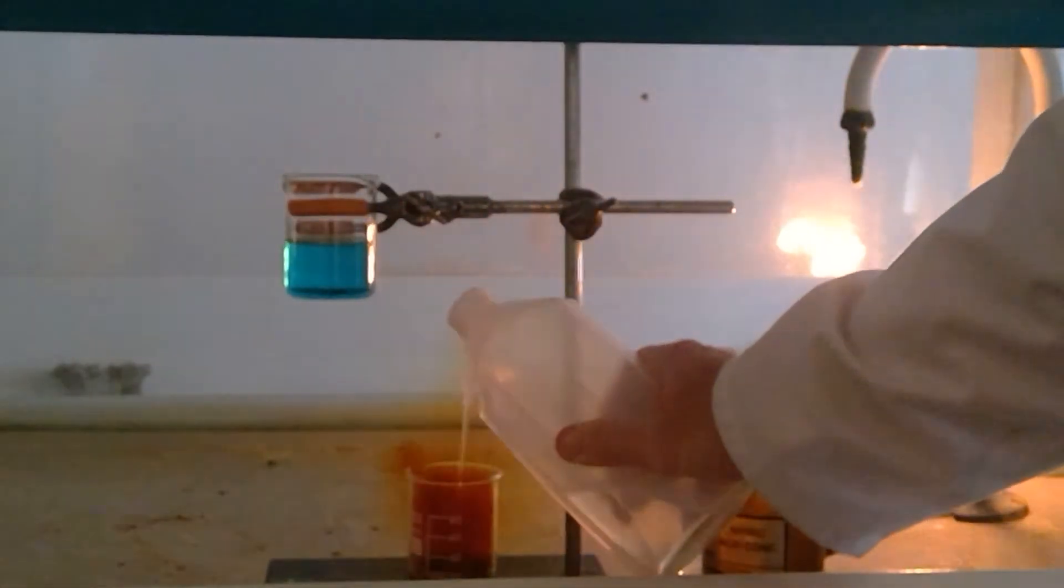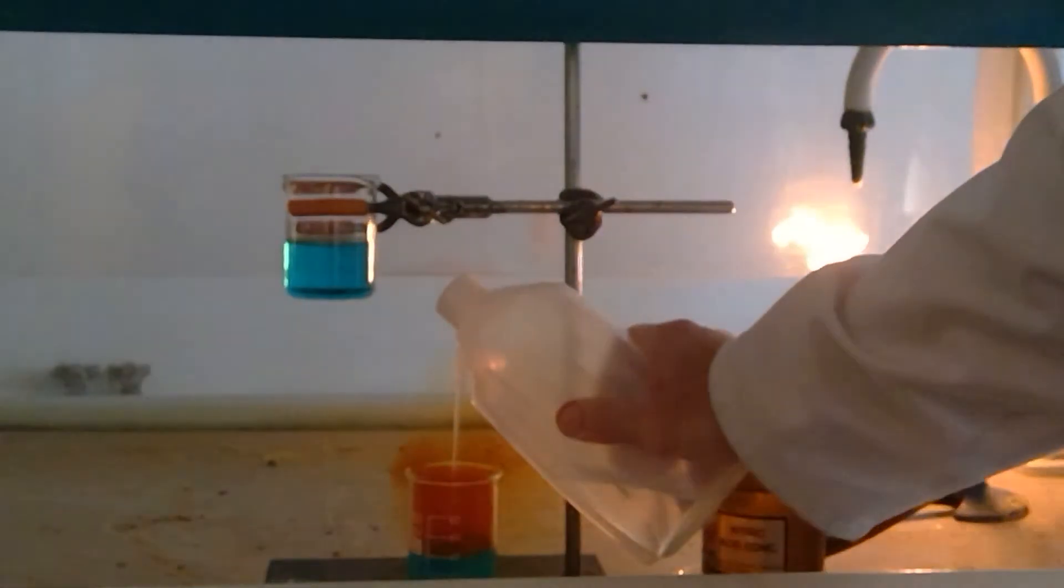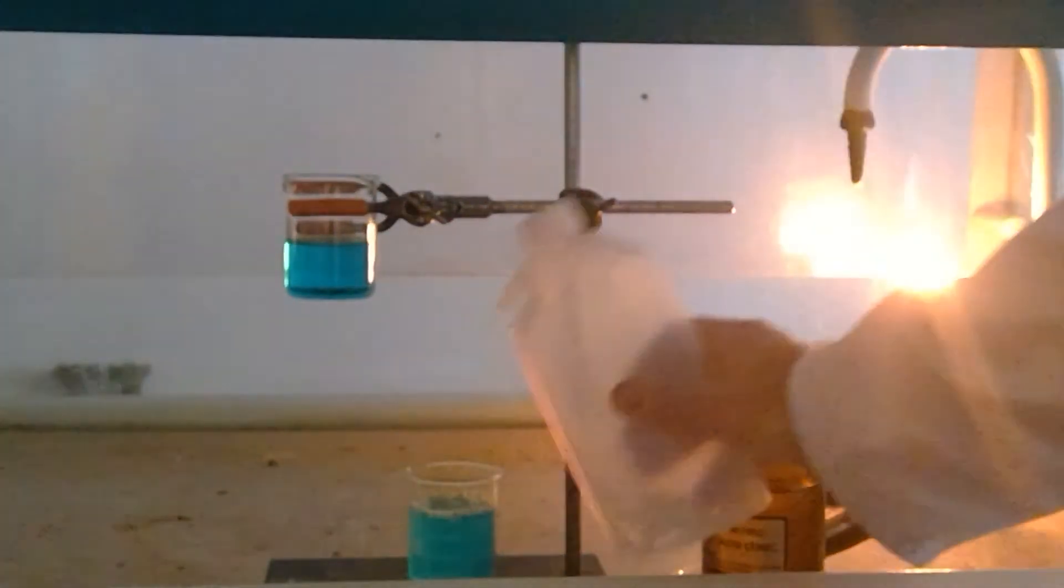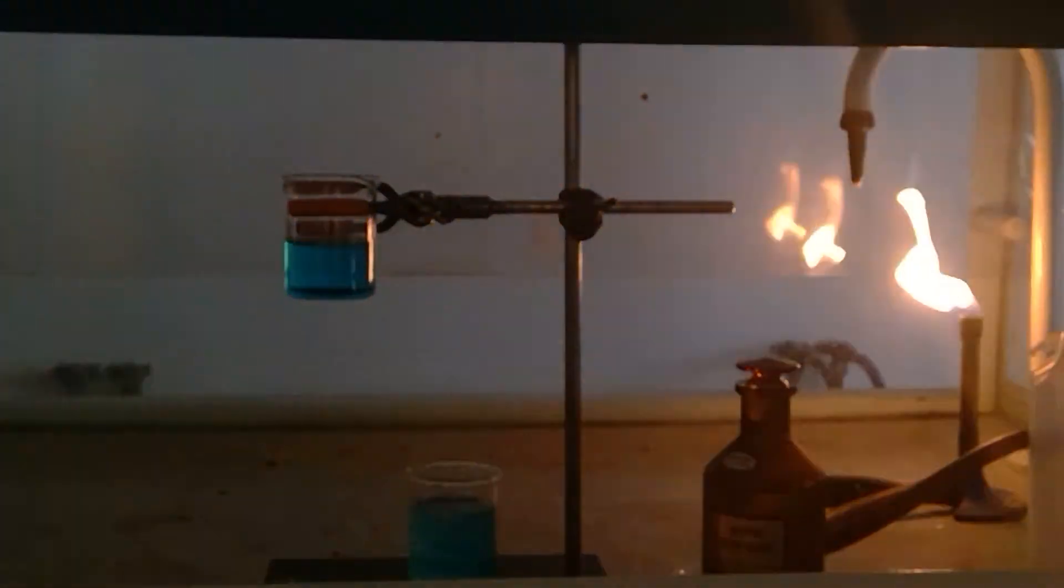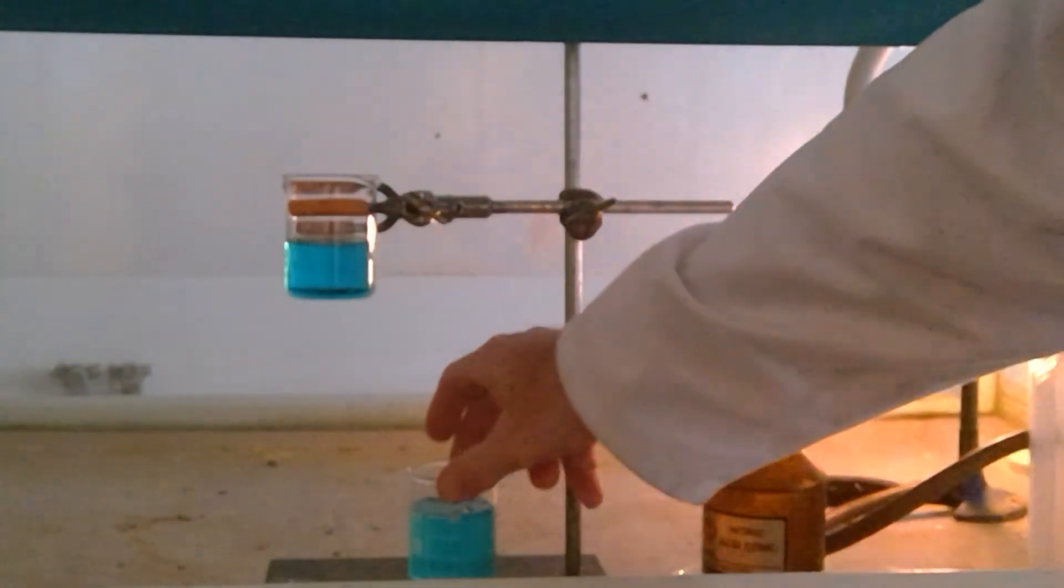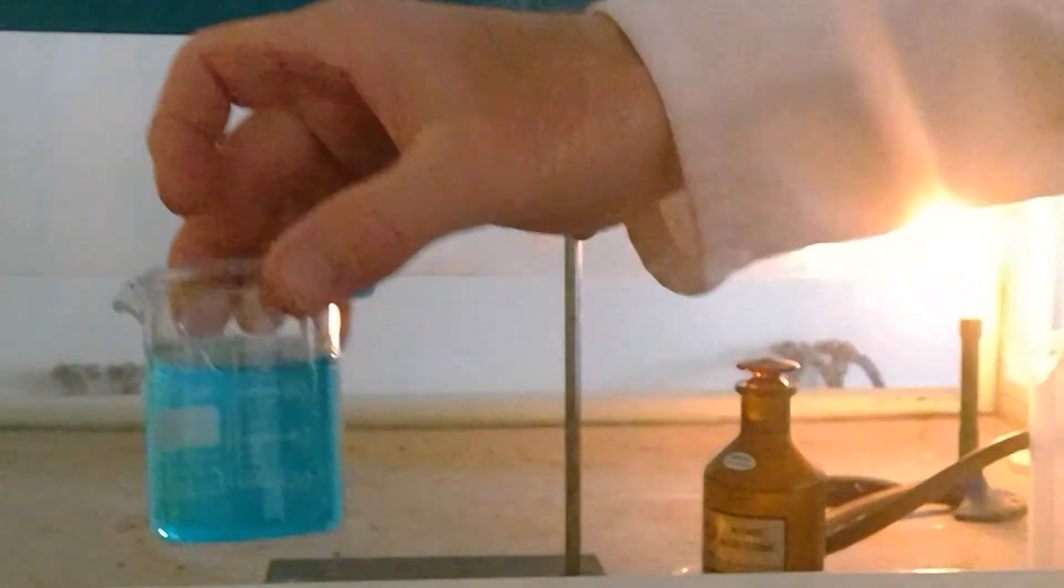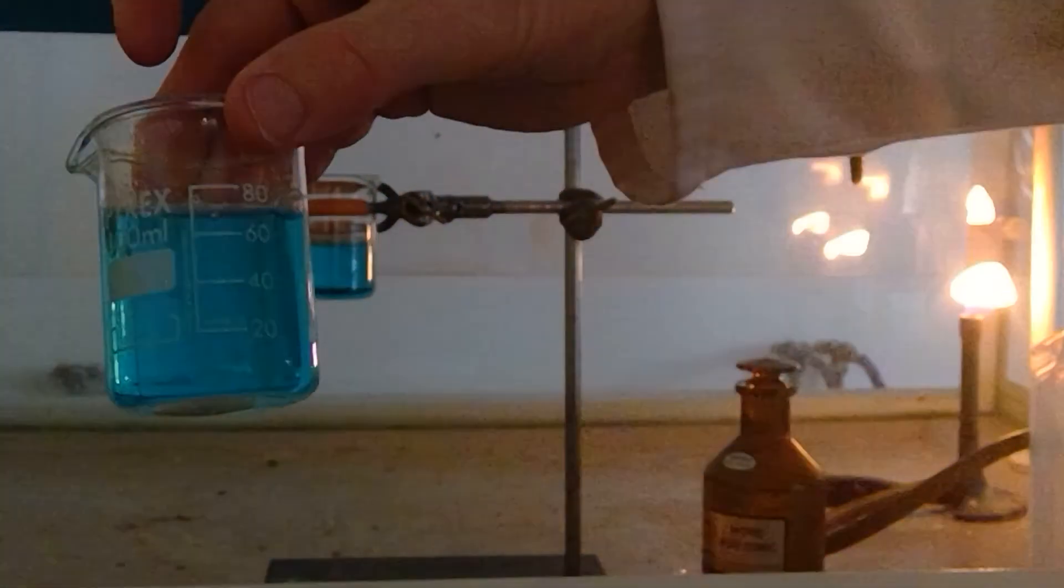And then to slow the reaction I will dilute down the combination and you can see again you have the blue color of the copper nitrate solution and the coin has in part disappeared.